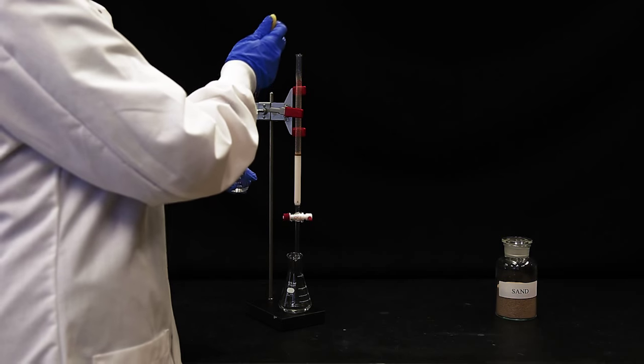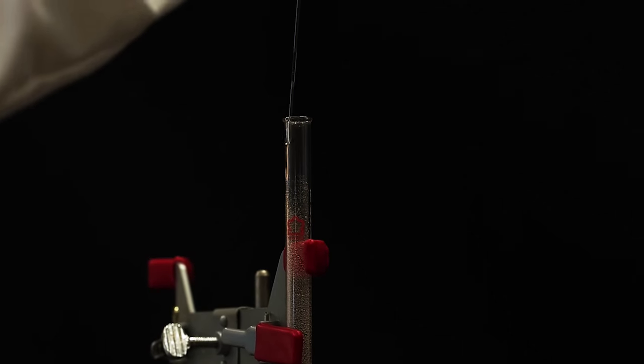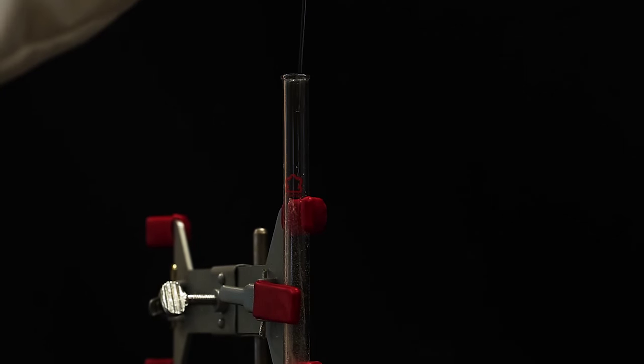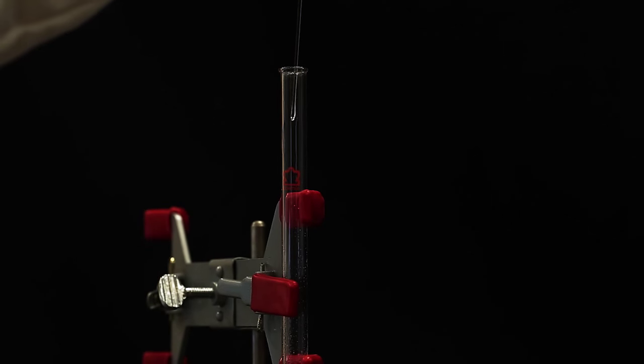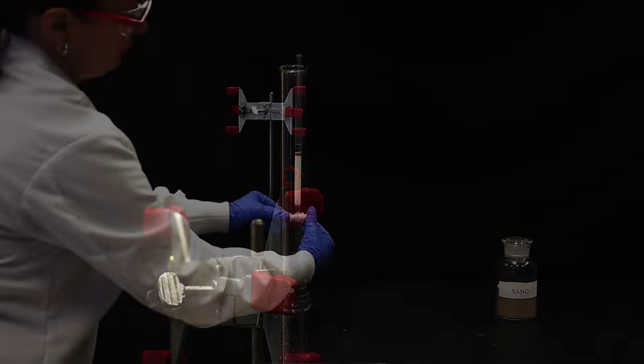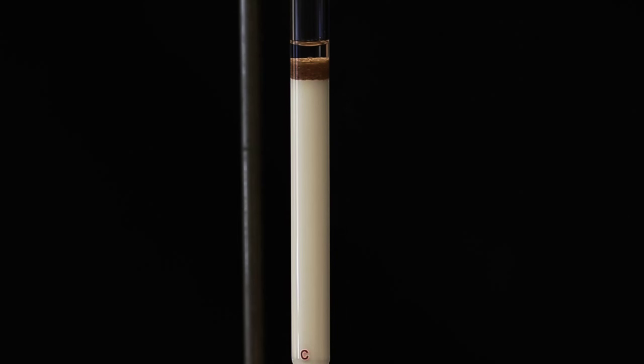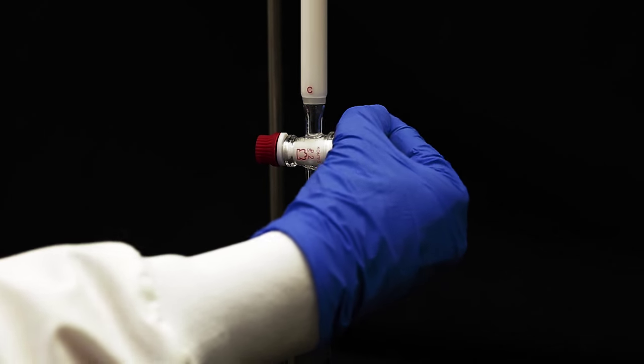Pipet hexane around the top of the column to wash the sand off the glass. Drain any excess solvent from the column so the solvent line reaches the top of the sand and close the stopcock.